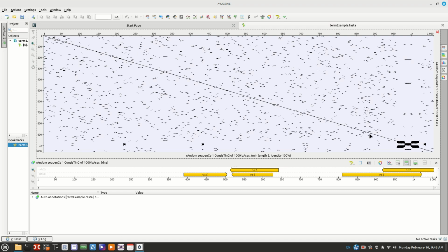Aha! Now, if you look down here, what did we find? We found this really strange piece. Everything else is kind of random, and we found this piece down here. Of course, it stands out more than it should. But you can see that the sequence we put in created a really interesting figure down here. So let's zoom in on this.